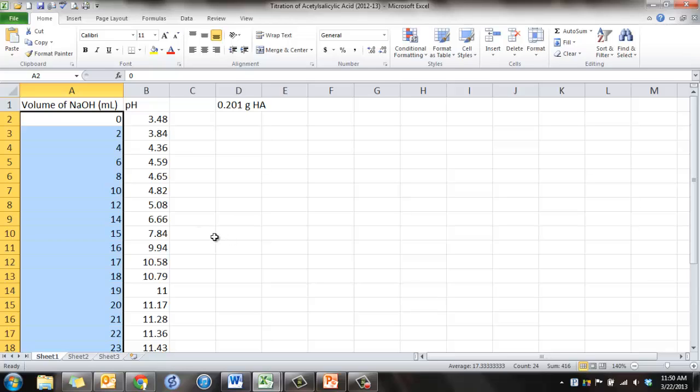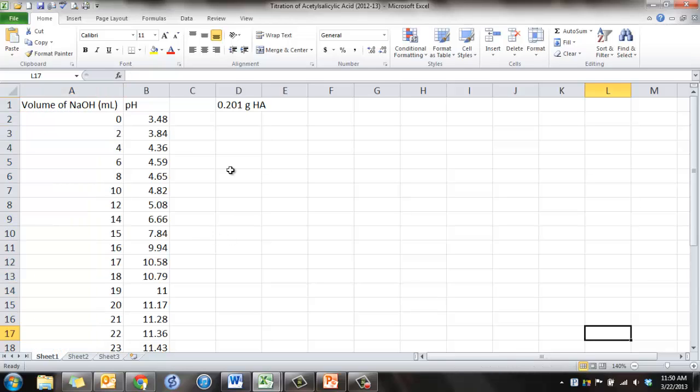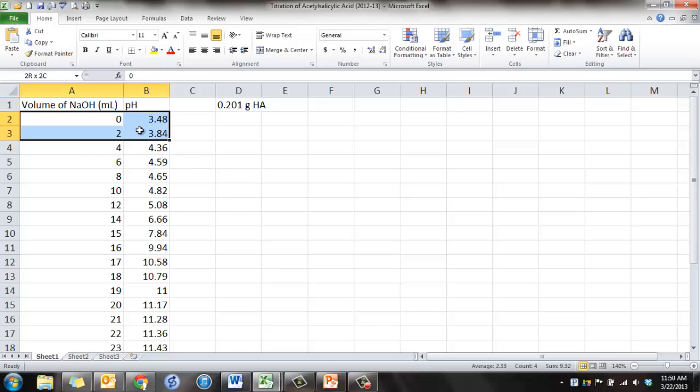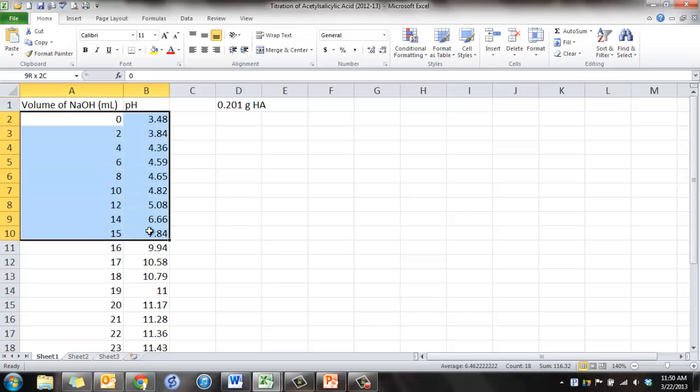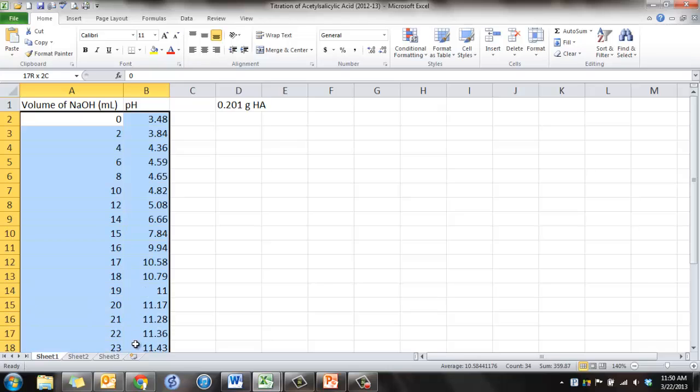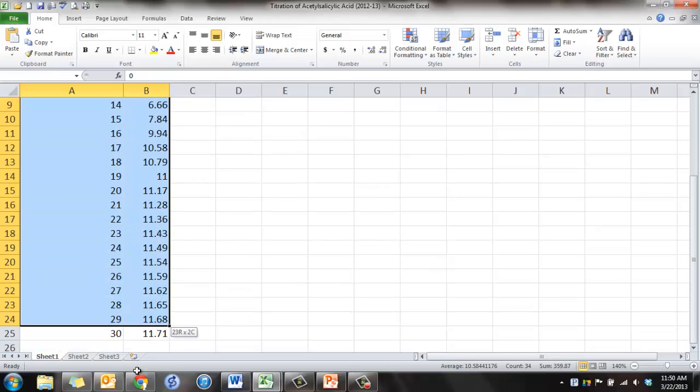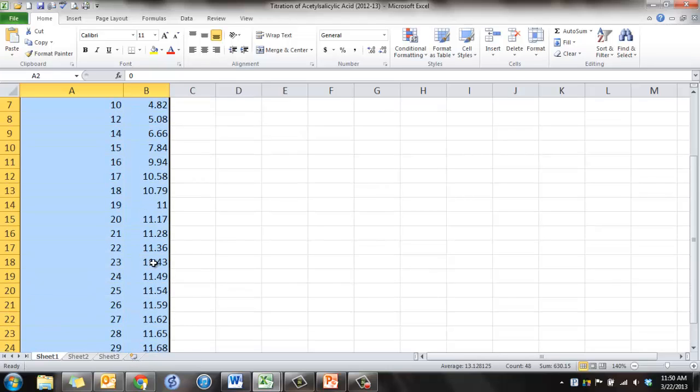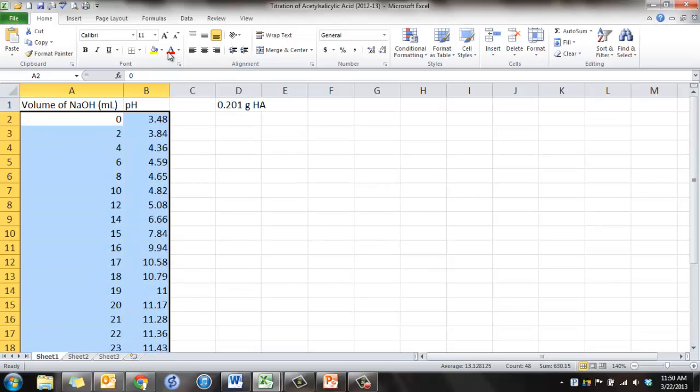And when you're done, we can move on to the next part. Alright, so you want to plot the data and make a graph. What you're going to do is highlight your data, and just the data, don't highlight the actual headers there. Get all the data highlighted.